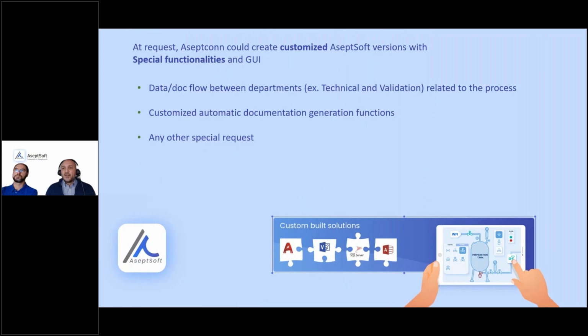Upon request, we can create customized AseptSoft versions with special functionalities and graphical user interfaces. Data and documentation flow between departments, for example, technical and validation related to the process. Customized automatic documentation generation functions or any other special requests.